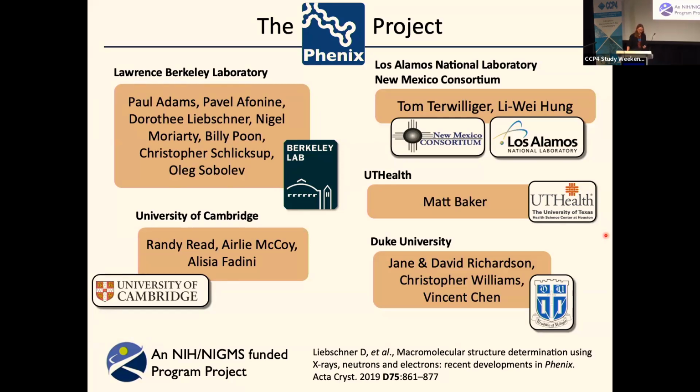So if a structure has lots of long helices, that might be something that, even if pLDDT is very high, might be a little bit disturbing for molecular replacement.